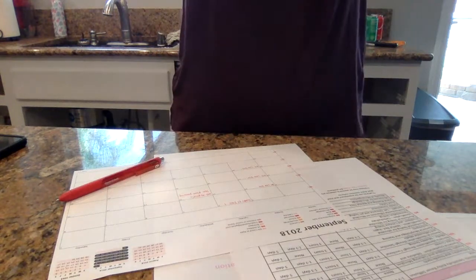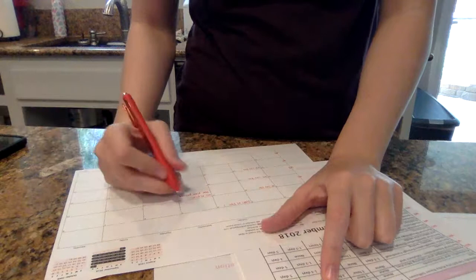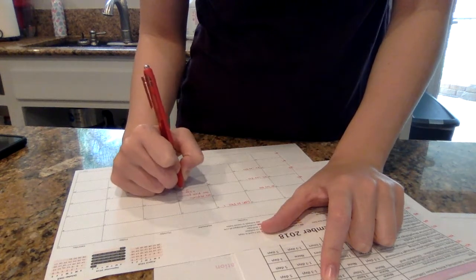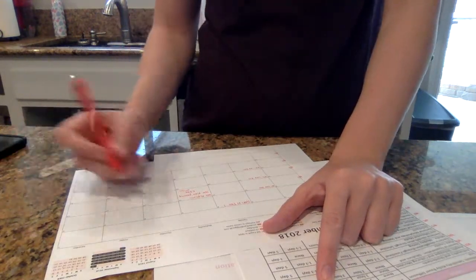The active time is about 3 hours, and then my incubation is 1 to 3 days.